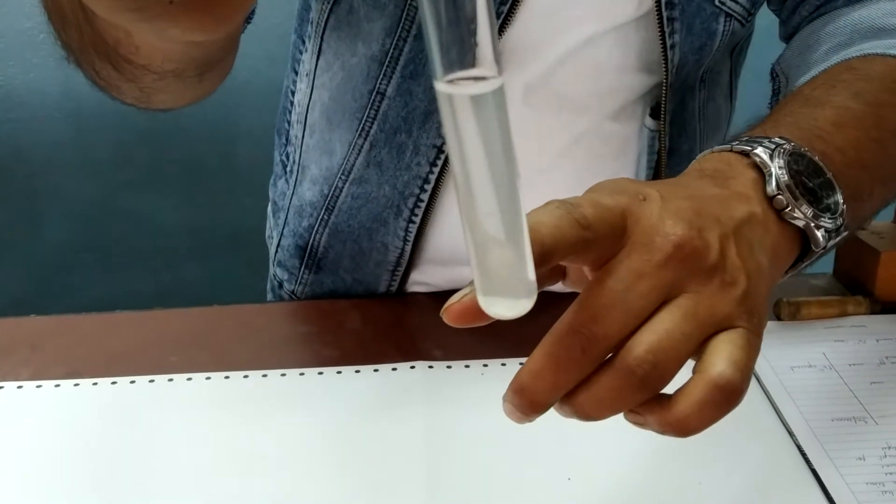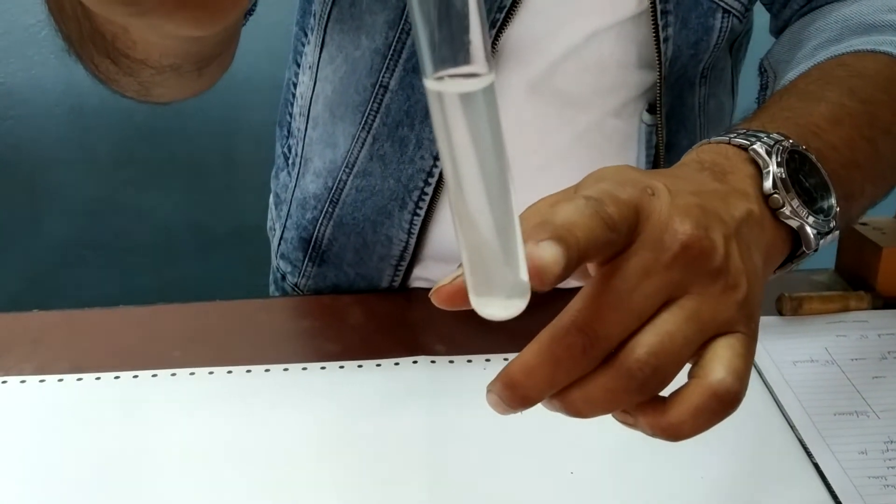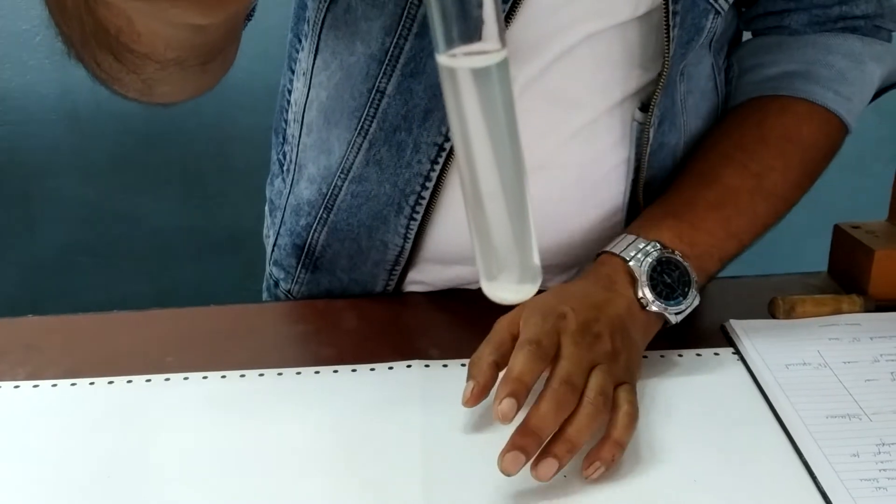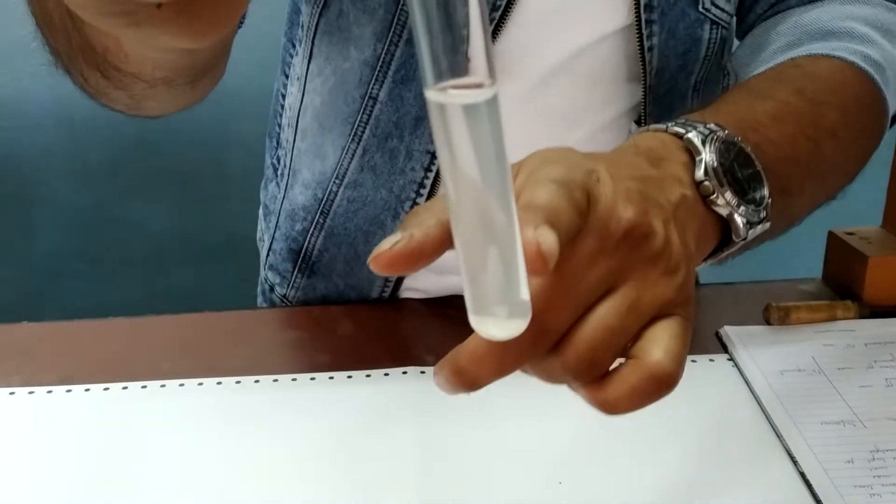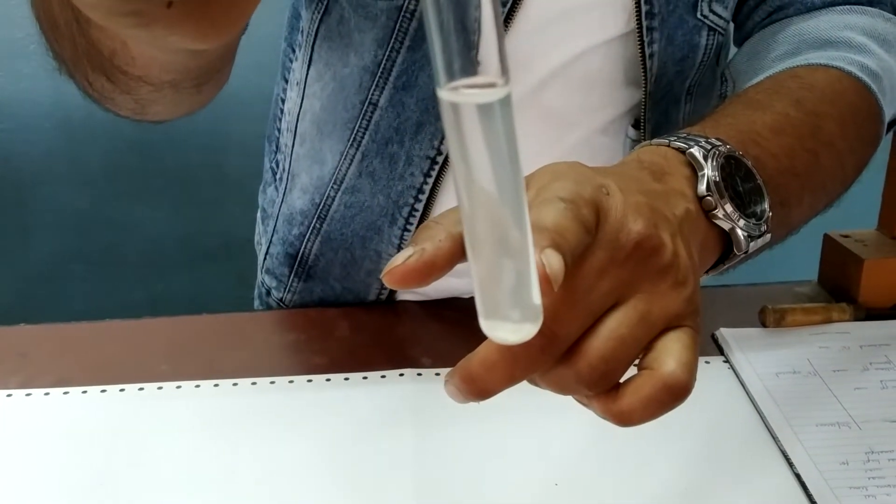After adding HCl as you can see the white colored PPT is there. With this PPT we will perform the test for lead.